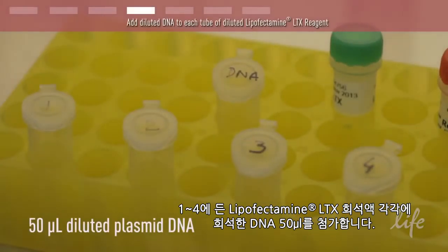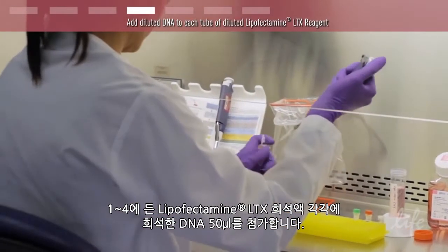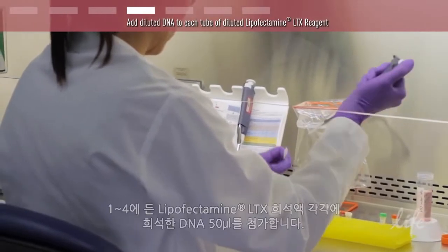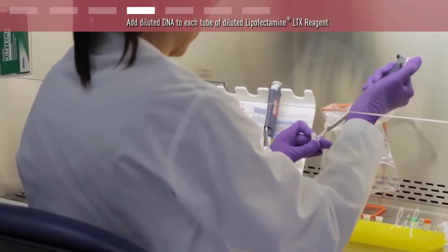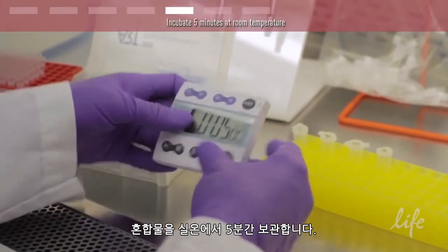Add 50 microliters of the diluted DNA to each of the Lipofectamine LTX dilutions in tubes 1 to 4. Incubate the complex for 5 minutes at room temperature.